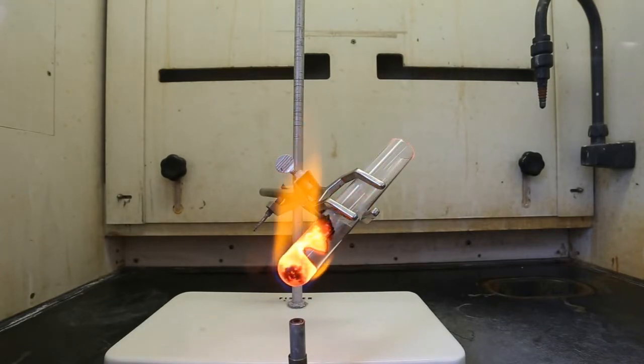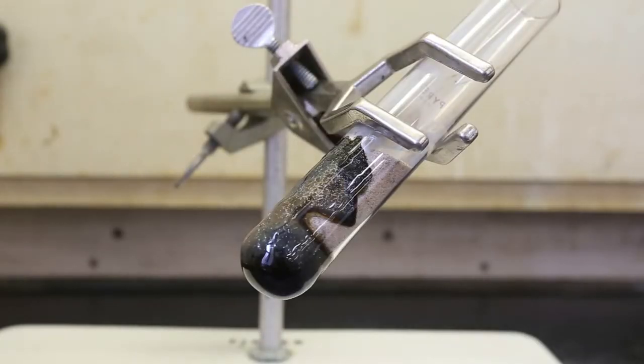In terms of mass, this means that the magnesium metal should always be about 1.6 times the mass of the silicon dioxide. The heating up of the test tube is time-lapsed, but the burning of the magnesium will be played in real time. When heating the test tube, it should be pointed away from you at all times. There is a risk of burning magnesium flying out the front. Here I have time-lapsed the cooling of the test tube, and you can see that it slowly cracks as the test tube cools down. Don't worry about this because the magnesium silicide has coated the inside of the test tube and it will prevent it from falling apart.